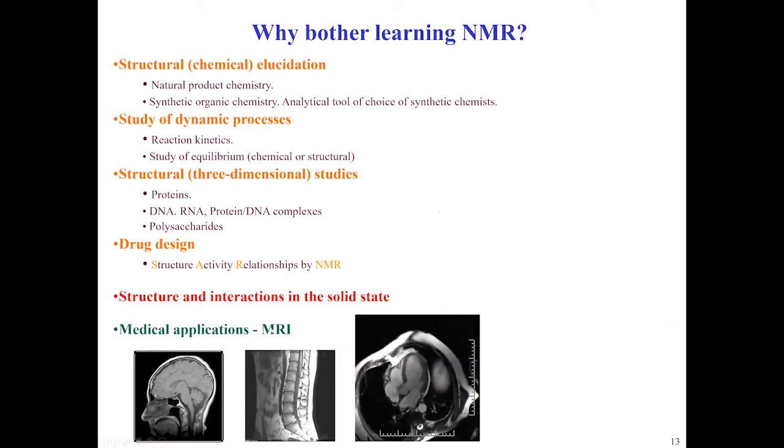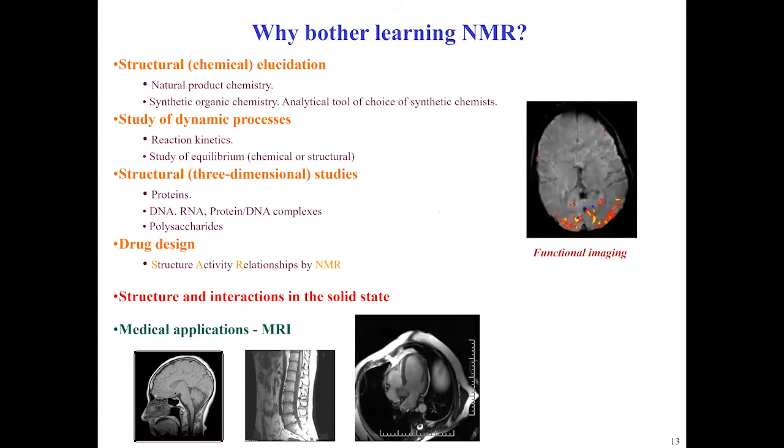I did mention that magnetic resonance imaging is, I call it a little cousin of NMR, of course, providing anatomic details of the process, of course, being complementary to X-ray scans or CT, and looking at the soft tissue, so really complementary.